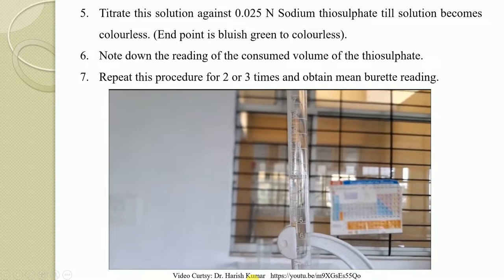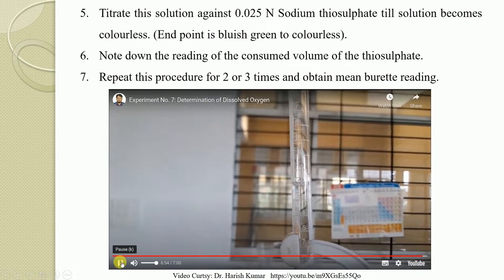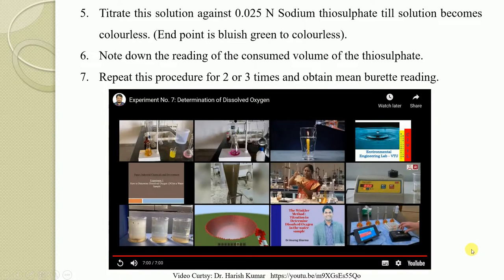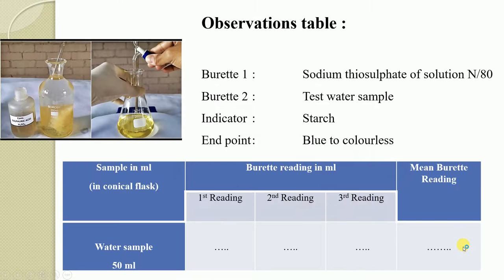Note down the burette reading, that is the volume of standard thiosulfate consumed, in order to find out the amount of dissolved oxygen present in the solution using the formula given in the manual. Okay, so in this way you can complete the procedure.